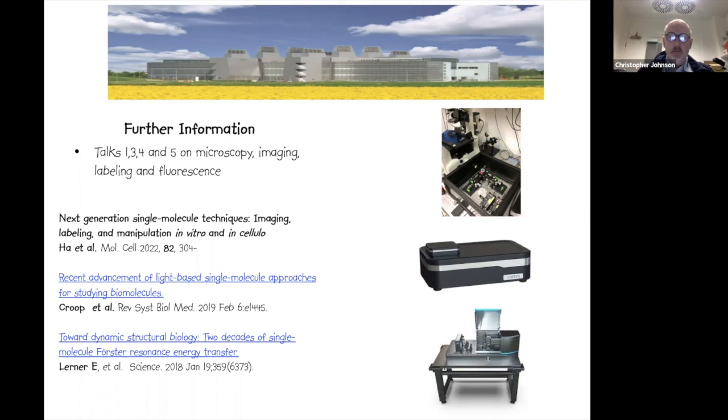Well, as far as I know, since we haven't been trained on the instrument, we should be able to make pretty well any type of measurement that you wish. If not, the idea behind the type of imaging that we have is that we can access the instrument in the biochemistry department, and they may well have systems which they need, which would be most optimally addressed using widefield or TIRF. And therefore, we will trade time on the two instruments. So that's not really an answer, but get back to me again and I will address that once we've been trained, which will be shortly.